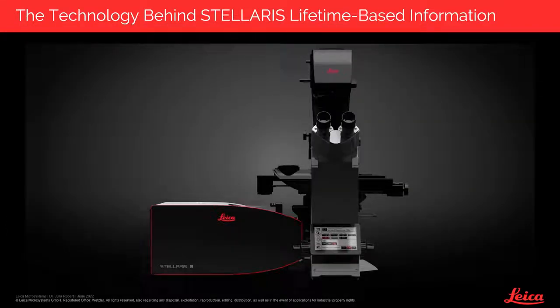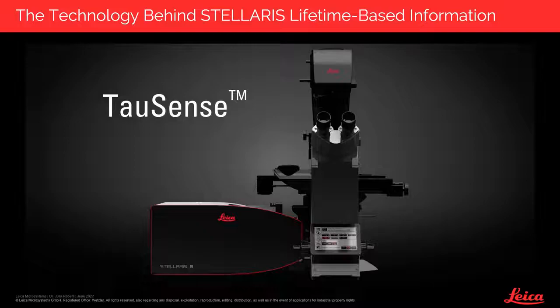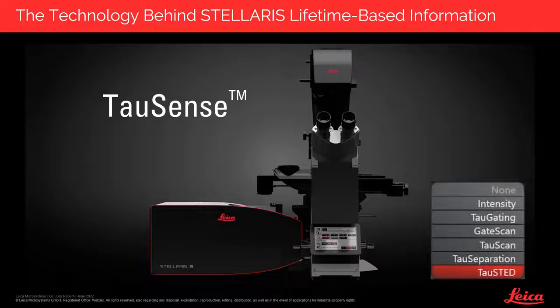And Stellaris is equipped to have access to lifetime-based information with this technology and a set of tools to address different aspects, as we have seen, in the form of tau contrast and tau separation, to study the endosome maturation and get functional insights on this process. But the same technology that serves for this purpose and gives access to lifetime-based data also enables tau-STED.